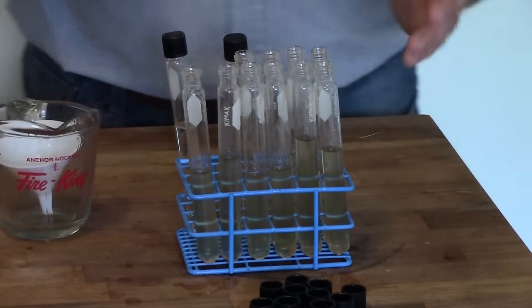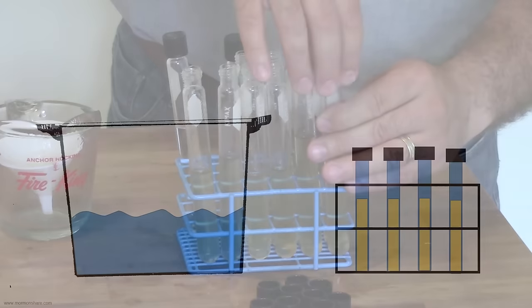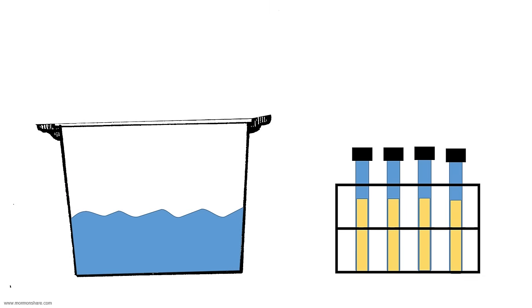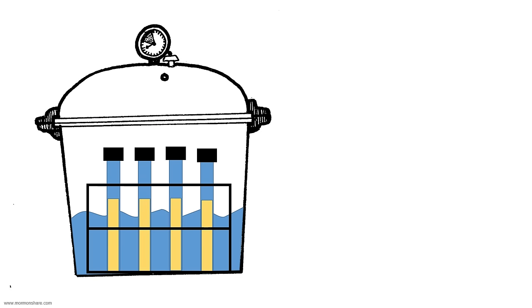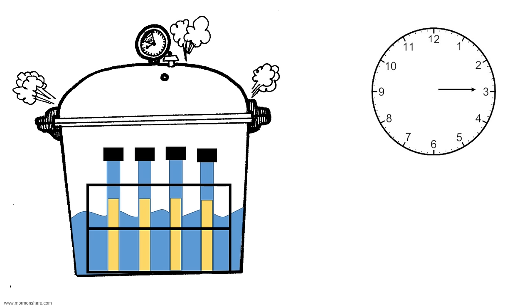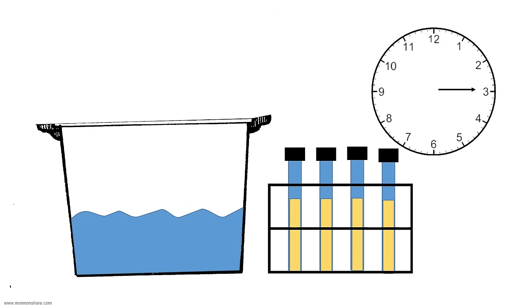So what you want to do once everything is capped is place it into a pressure cooker that's been filled to roughly the same level as the agar level in the tubes. You want that water to have been preheated so it's almost boiling. And you're going to take this rack, you're going to put the whole rack in there, seal up your pressure cooker. Make sure it's on its maximum pressure setting. And once that pressure valve starts to whistle, set a 15 minute timer. At the end of that 15 minute timer, kill the heat, let it cool down to below boiling, and then remove your tubes. And that part is absolutely essential, that's what's going to sterilize our tubes. So you need 15 minutes at full pressure.